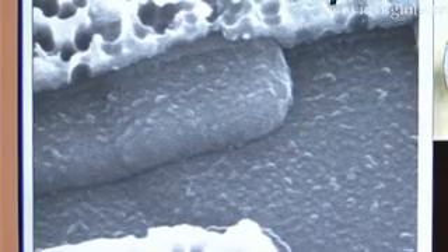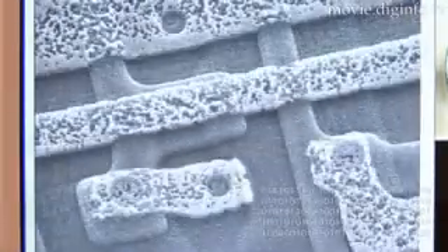Non-conductive specimens can also be observed when the low vacuum option is added.